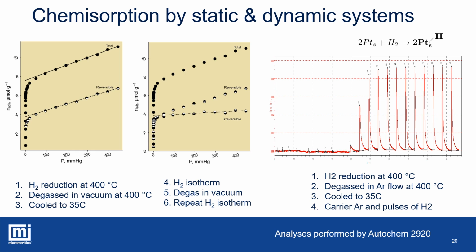Other reversible effects might occur, like the phenomenon of absorption, that is a gas dissolution into the bulk metal, like hydrogen in palladium. The flow dynamic method in chemisorption usually fails to detect reversible interactions, as the catalyst is constantly submitted to an inert carrier flow. The static manometry technique can provide more information about the surface reactivity, but the experiment might take a longer time than the dynamic technique.